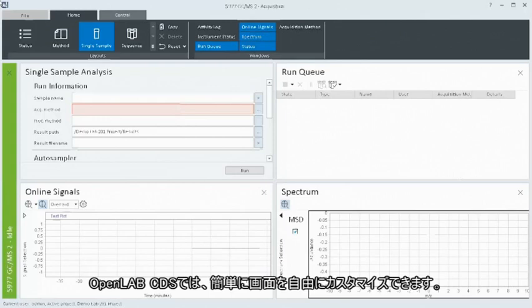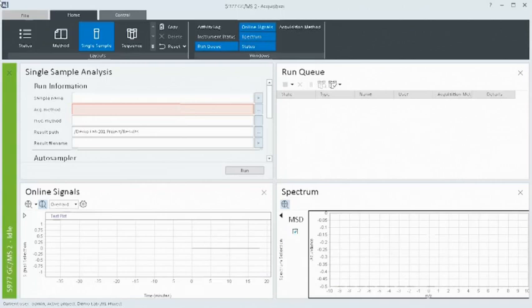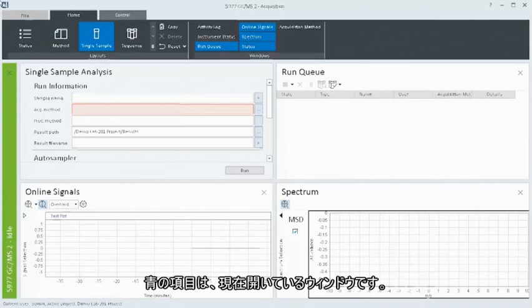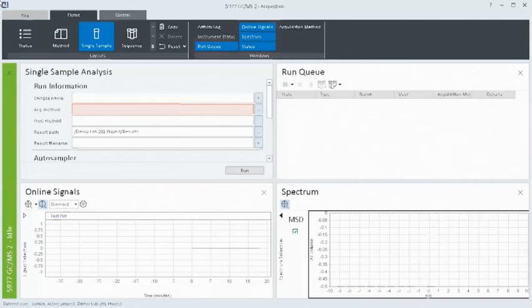OpenLab CDS can be easily customized to suit your viewing preferences. The blue highlighting indicates an open window.